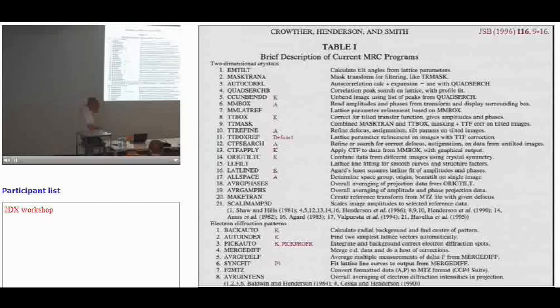And so far in Cambridge, we've used it on three different crystal forms of bacteriorhodopsin in 3D, three different crystal forms of rhodopsin, bovine and frog, one halorhodopsin, and then Iban, I think, is the most recent person who took it through to a full 3D structure, which was the EmrE structure. And then most recently, Vinoth Kumar has been using it on 2D crystals of rhomboid, and I'll talk to Ivan about this a little bit later. So anyway, that's the list, and this is what they were originally called or had reached by 1996.